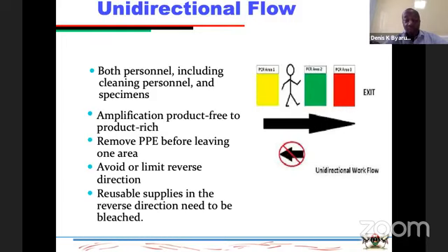We also recommend that to avoid any potential crisscrossing, you dedicate specific laboratory protective gear for each of the rooms, so that if you have colleagues, they sample from a clean area with the dedicated clean area gear. That also serves as a reminder: if you have different colors, they can help remind you which area you're working in, so that you can be a little bit more careful.